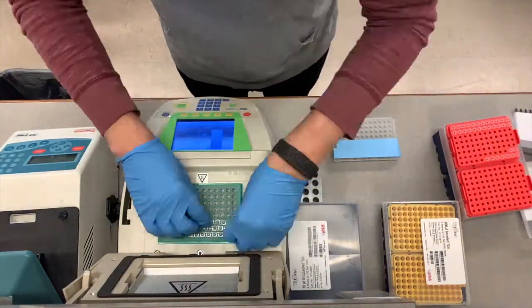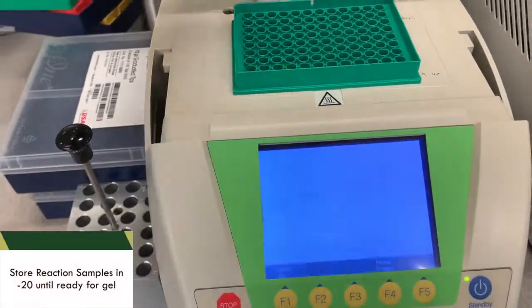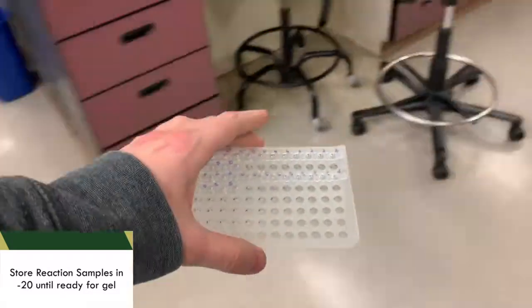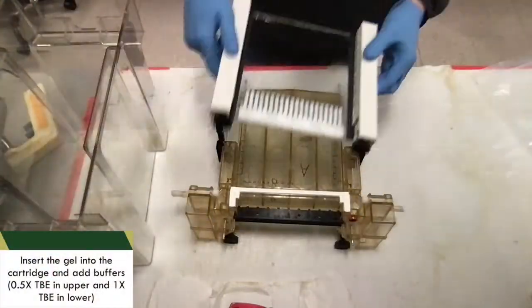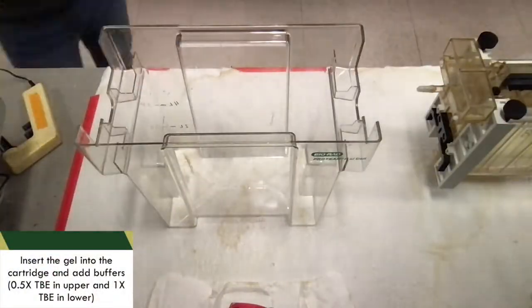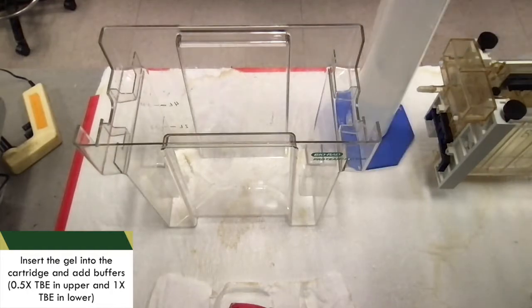Okay, after the quenching step has finished for our reaction, we're going to go ahead and place this in the -20 to sit overnight. And then the next morning, we're going to come unwrap the gel and load it into the gel box. You can see that we tried to get it really tight in there. And then we're going to start making the buffers.